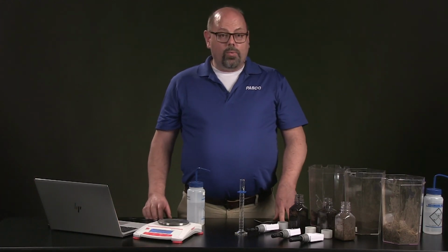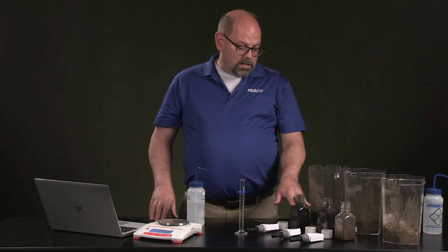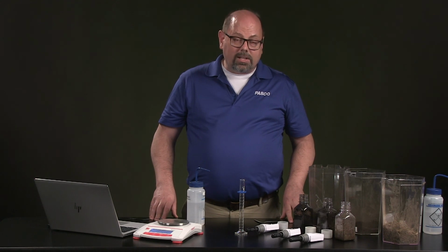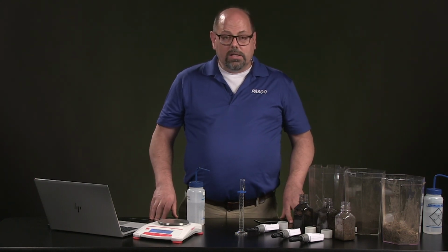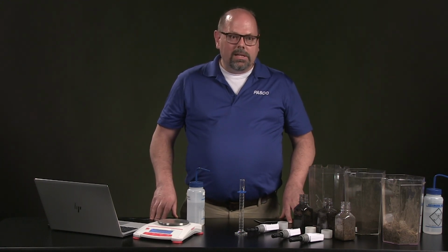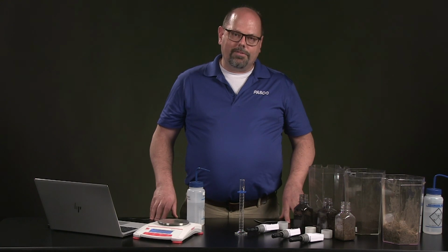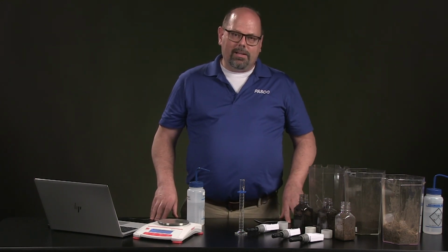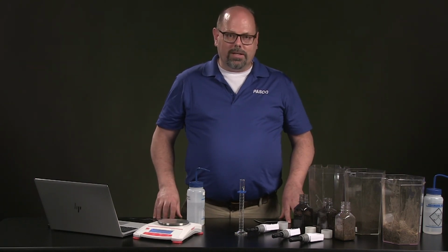So now we're just going to wait for an hour. And if it's still in the lab, you can just mark it as even half an hour. That's fine. And if you come back to lab tomorrow, you can measure it again, and then again on the third day. Get somebody to come in after school so that you get more than just a few data points to see how these progress. That way we can enter in that data and look at the difference in these three graphs. Let's come back in a little bit, once this water's soaked in and some of the biological activity has been encouraged by the water, to see what the new rates are.